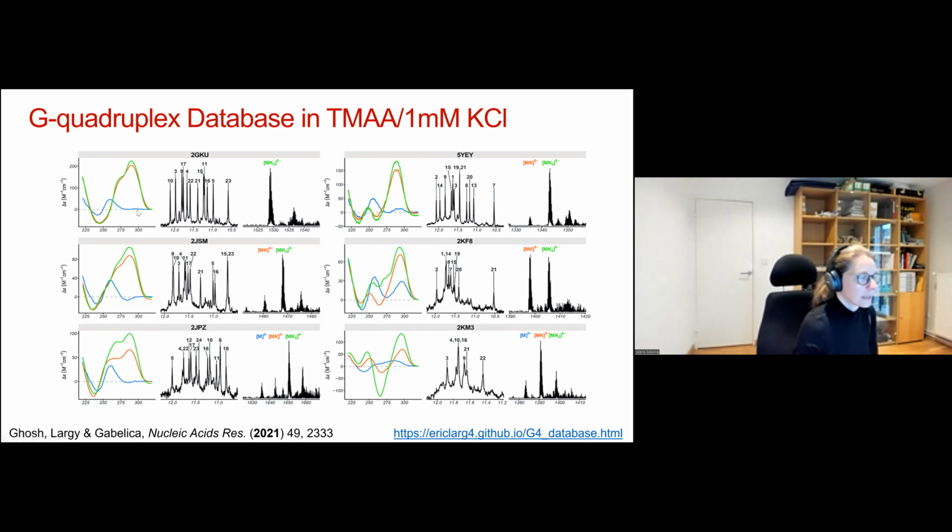And here is the unfolded one. We also documented the NMR spectra in the mass spec conditions, so you can verify it's the same structure as in the high KCl concentrations. And we have documented a database, so it's both in this paper and on Eric Largy's personal website, where you can browse a bit more smoothly.